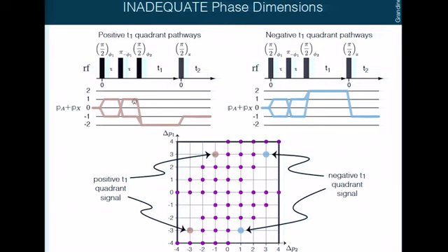So I'm going to use this third pulse. I'm going to put a phase here, so another dimension. And then when I do a double Fourier transform, I can see the dots here. We do this in my lab all the time. You'll see the double Fourier transform. You'll see all these dots.